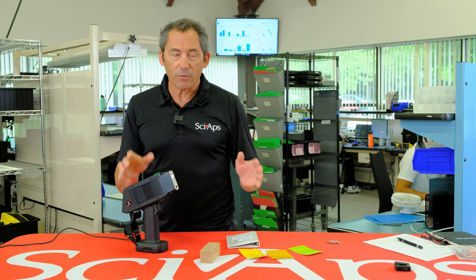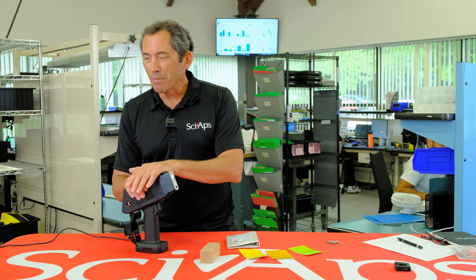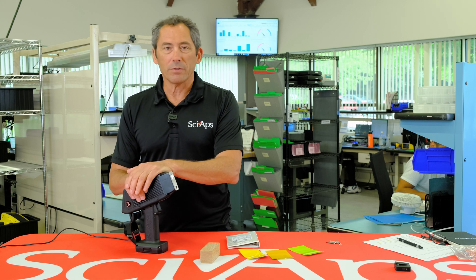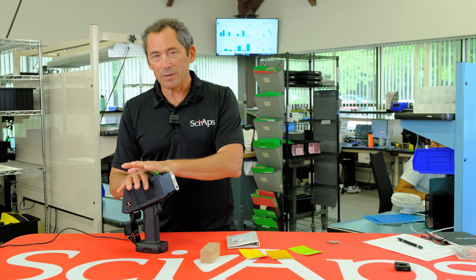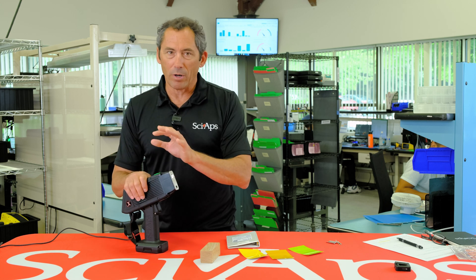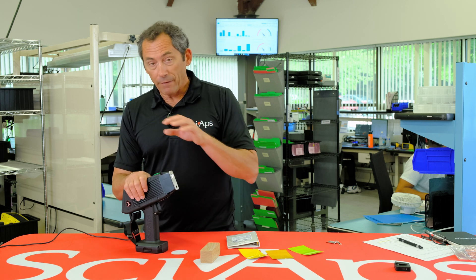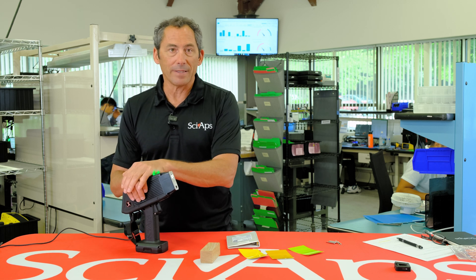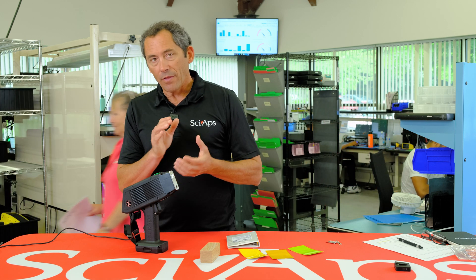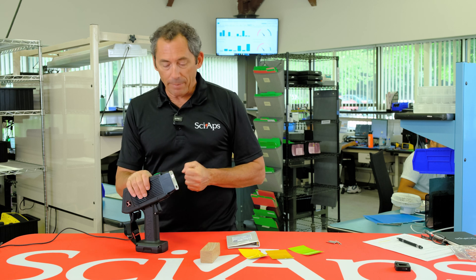People say these x-ray tubes are fragile, but they're not. X-ray tubes have been in this kind of device for almost 20 years, used in scrap yards and oil fields where they get beat up all the time. They're a very rugged device. It's been a relatively new development that we can put them into a device and get a HUD PCS. The key is an x-ray tube combined with an x-ray detector, a good algorithm, and you can get your PCS and use it for lead paint testing.